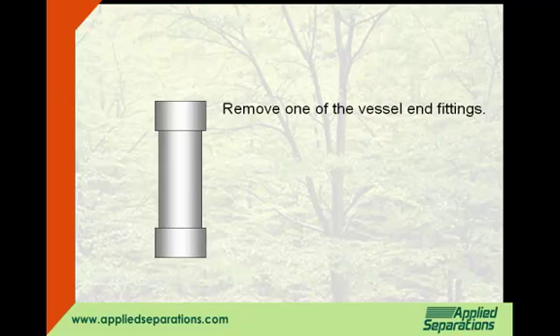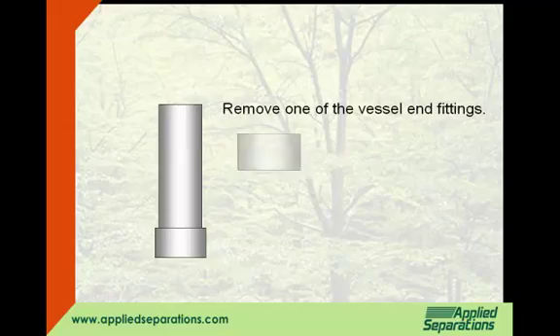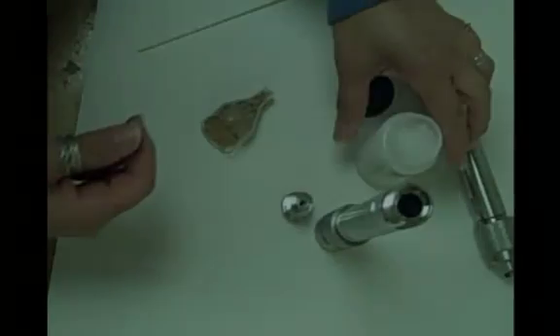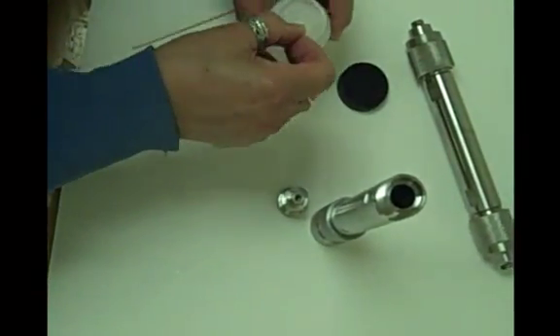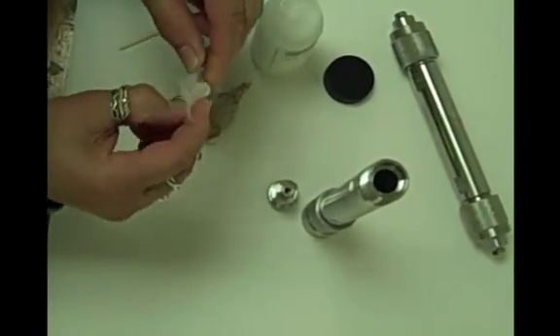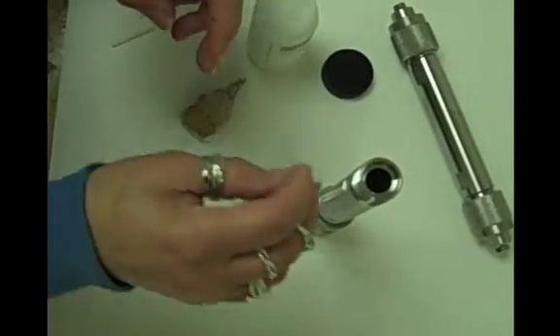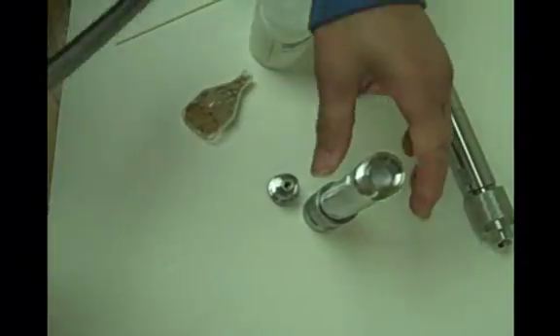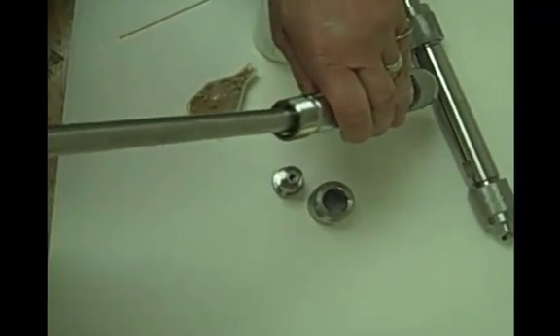First, remove one of the vessel end fittings. Push a piece of glass or polypropylene wool to the bottom of the vessel with a tamping rod.